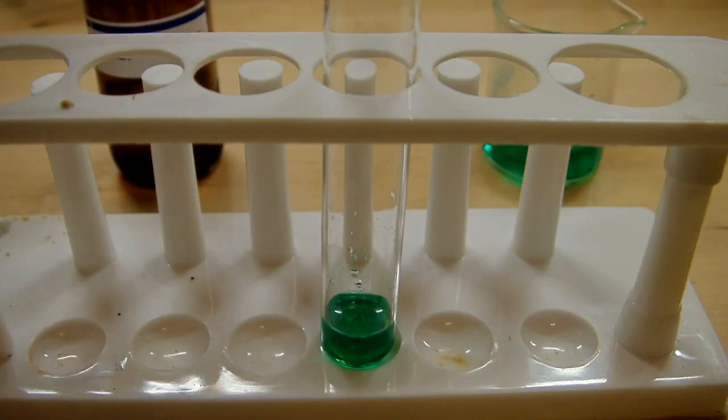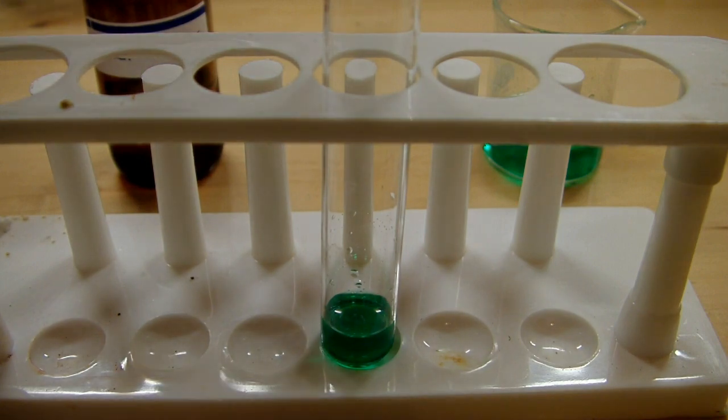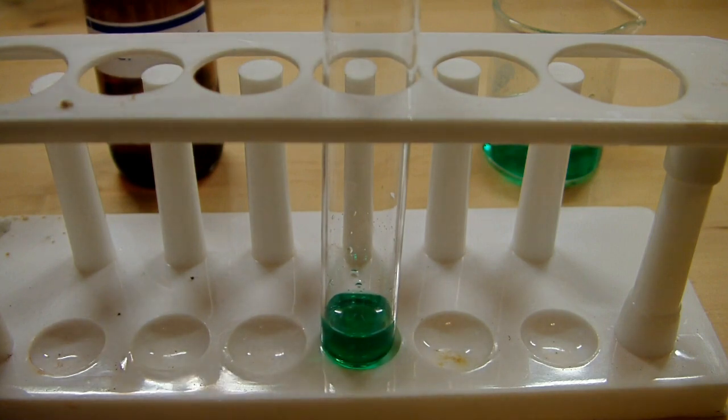I've transferred two milliliters of the solution into a test tube, and now I'm going to add the concentrated ammonia. As you can see, there's a nice emerald green color, and when we add the ammonia, we should see a series of pretty beautiful color changes. So I'll add this one milliliter at a time.